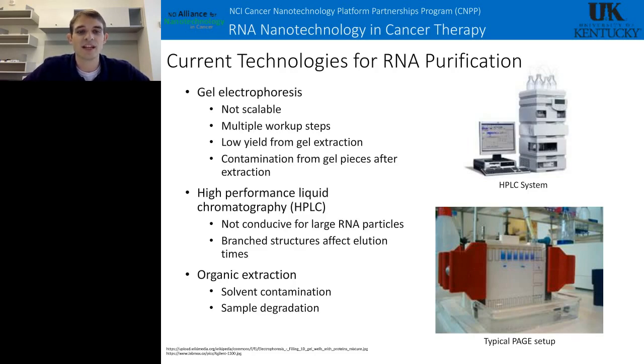And there's also organic extraction, which is used quite commonly. However, I believe it's quite easy to get solvent contamination, and then your sample can also get degraded, which, while it does decrease your yield, also introduces impurity in your sample.